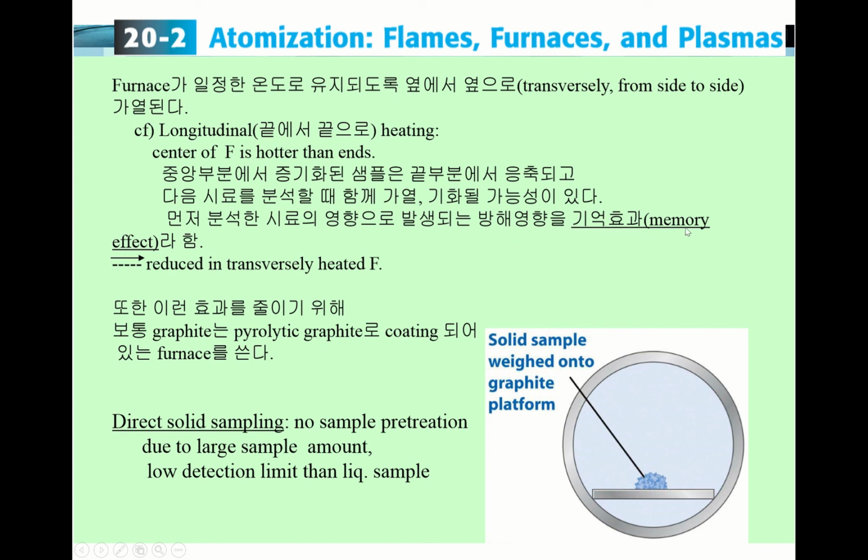That is called memory effect. With the memory effect, the analysis may not be precise. But in a transversely heated furnace, this memory effect will be reduced.